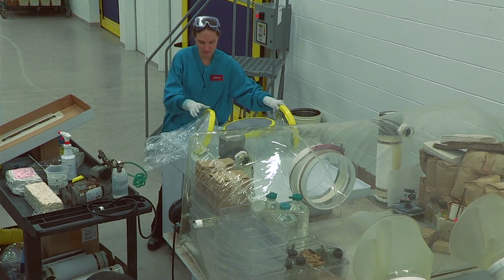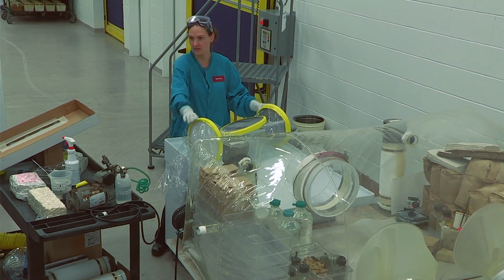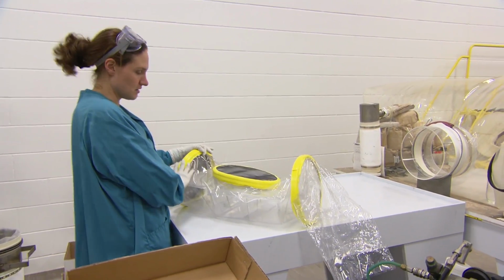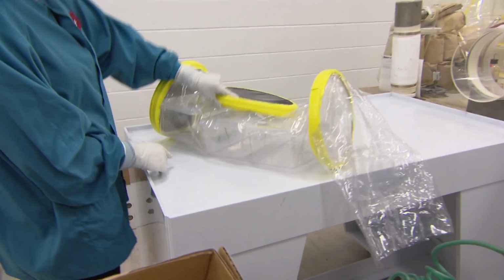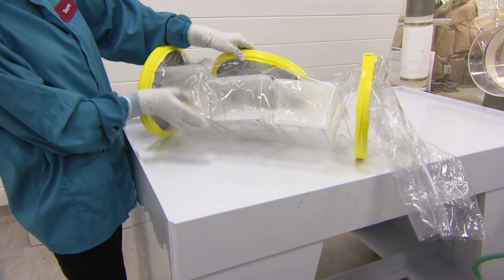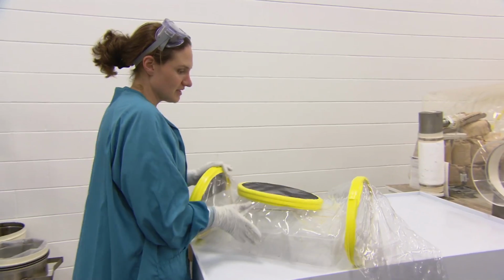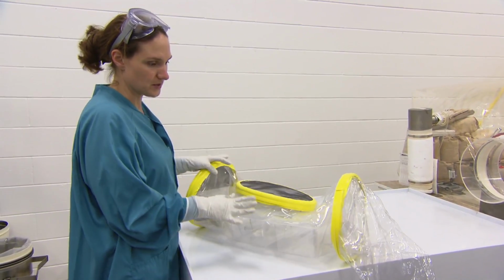So this shipper here, before we hook up, I always like to give it a look over. And so here where the animals are, this is all sterile, and we want to make sure that we don't have any holes where the animals could possibly be compromised. As long as nothing is found, we're good to go.